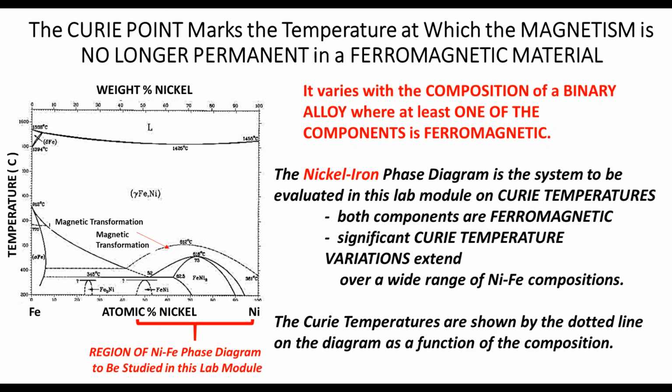For each test, use the plotted data to determine the Curie temperature of each sample. Since you may or may not have access to the Pyrus software, you can determine the onset or Curie temperature in the same manner by drawing tangents to the curves on either side of the inflection and find the intercept of those two lines.